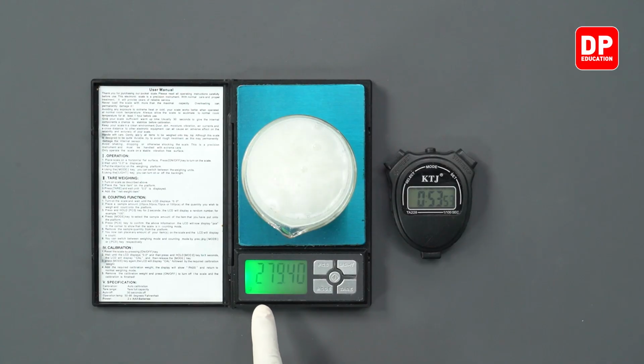Third reading is going to be 279.23. Fourth reading is going to be 279.02. Fifth reading is going to be 278.78.